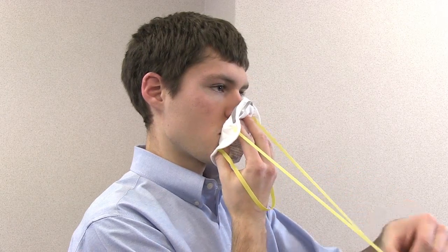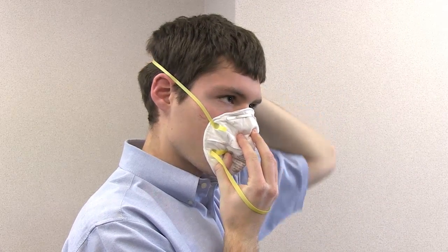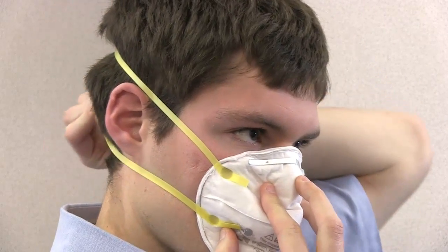While holding the respirator in place, stretch the top strap over your head and place it on the crown of your head above your ears. Continue to hold the respirator on your face and pull the bottom strap over your head and position it around your neck, below your ears. To create a seal, pinch the nose piece so it fits snugly on the bridge of your nose without gaps. Before entering the work area, perform a leak test.